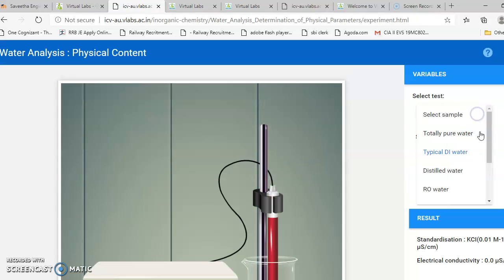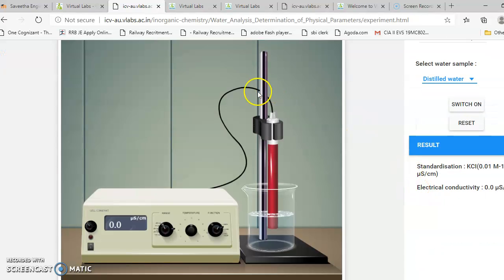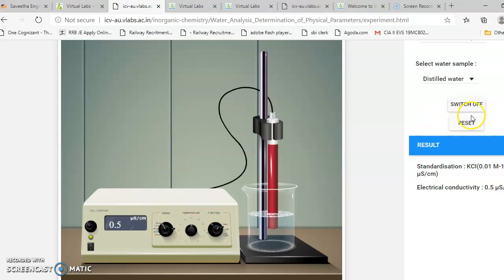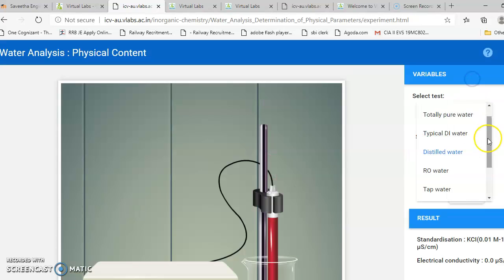Next, put the instrument off and choose the next sample — distilled water. You can see the difference between different samples. Distilled water has 0.5 micro siemens per centimeter. For each sample the conductivity will vary, and that is how we can measure the conductance for different samples like distilled water.